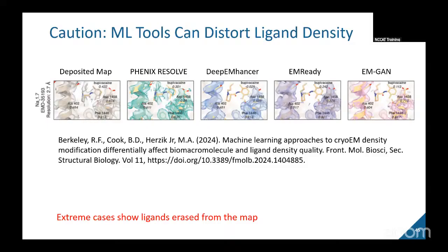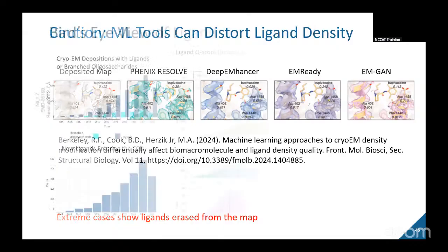They also said, if we compare both those structures, we can at least say this one part of the bigger structure doesn't undergo a conformational change when it's in the larger complex. So they were still hitting a biological question. So I do think being more comprehensive, or expanding the number of depositions to really highlight these various maps, is probably really important.